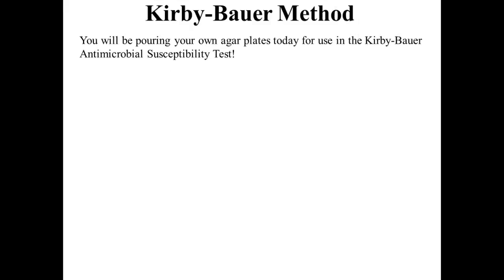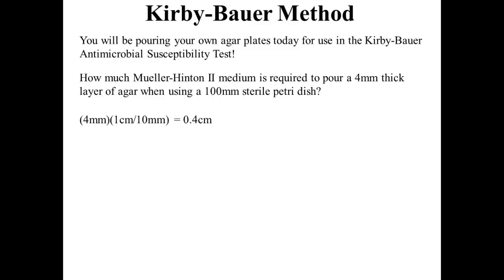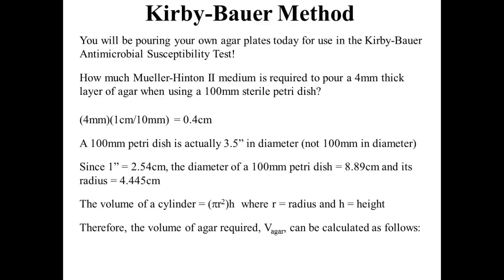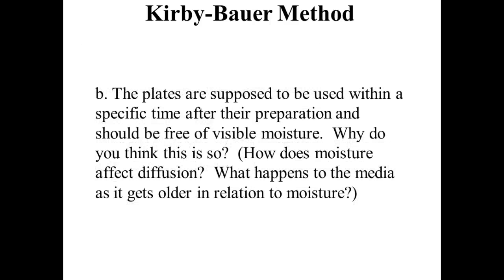And then Peter actually calculated it out. He loves the math. So mine is 25 mils. 25 mils were in that to create, based on the dimensions of the discs and the Petri dishes we use, what should fill it up to 4 millimeters deep.